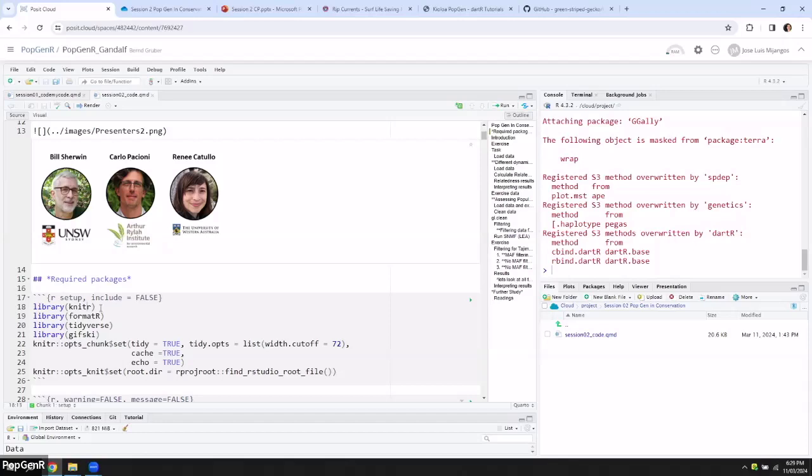I'm going to talk about how important read depth is for particular types of metric. To some extent, though, if you're also filtering on your read depth, doesn't that eliminate the problem? That's the point, yeah. It depends on the read depth you're left with. If you have quite low read depth across the board, you can't rely on your singletons very well, essentially.